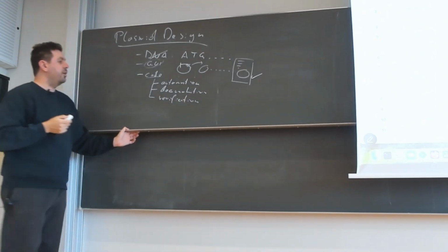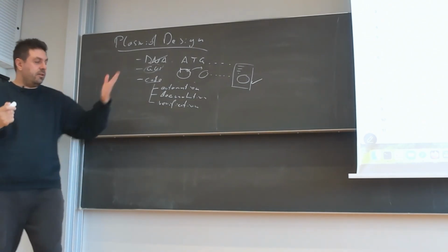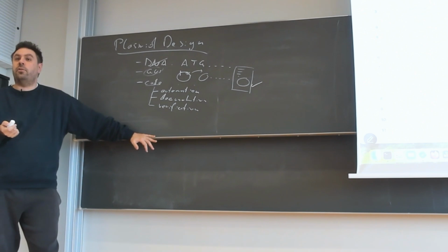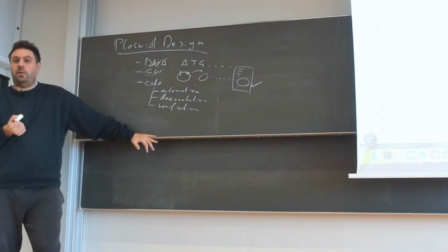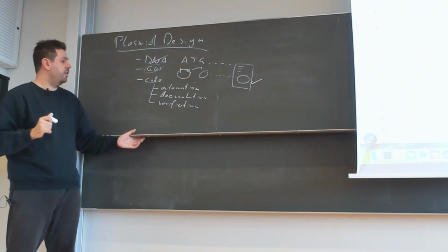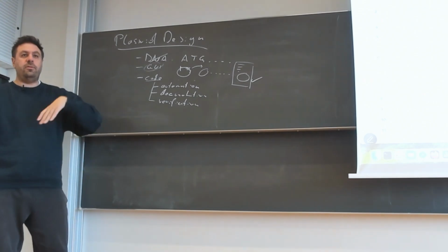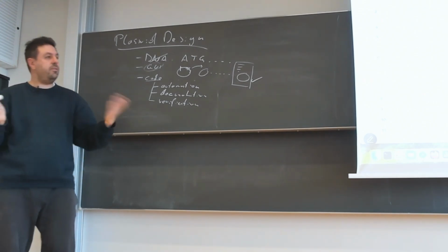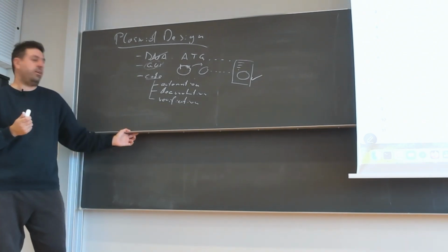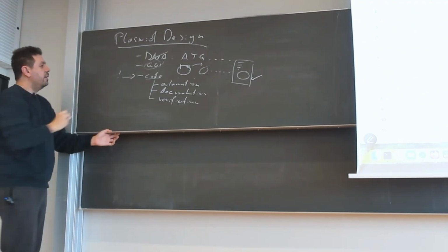So here of course, you can get arbitrarily complex with verification, code verification. What we did in this lecture and what we show here is putting nice checks and assertions at the right places. It's not totally verifying that your DNA will work in a bacteria, but you think, oh, this should have the same length as this, or this should be homologous or complementary to this. So let's just put an assertion here. Your code should be full of such checks. We strongly advocate this here. So let's do that.